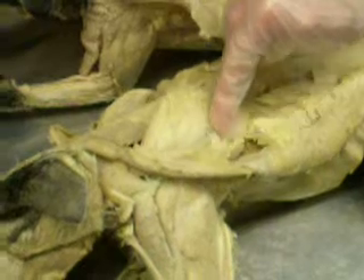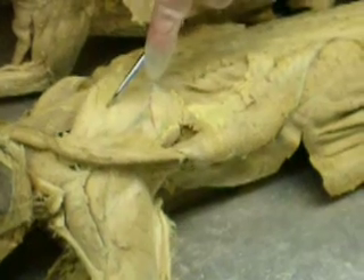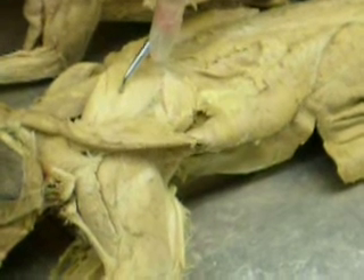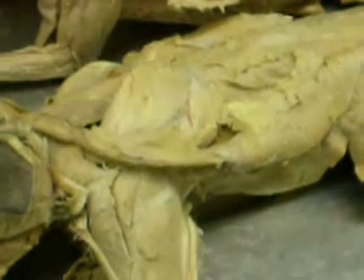This is the spine of the scapula, the shoulder blade. These are the rotator cuff muscles. The muscle above the spine of the scapula is called the supraspinatus. Where is the spine of the scapula? You can feel it — it's the blade, that's the spine. Above the spine is supraspinatus.